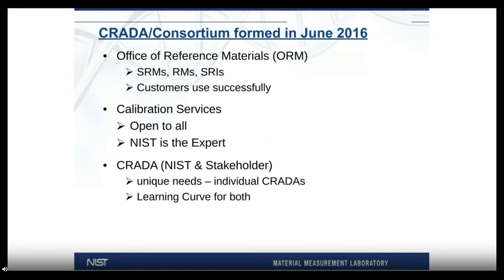So NIST offers a variety of services to our customers. We produce reference materials through the Office of Reference Materials. We also offer calibration services where NIST is thought of as the expert on a particular measurement.